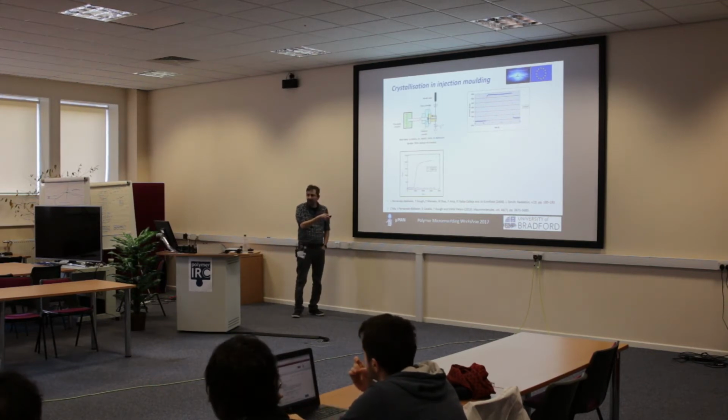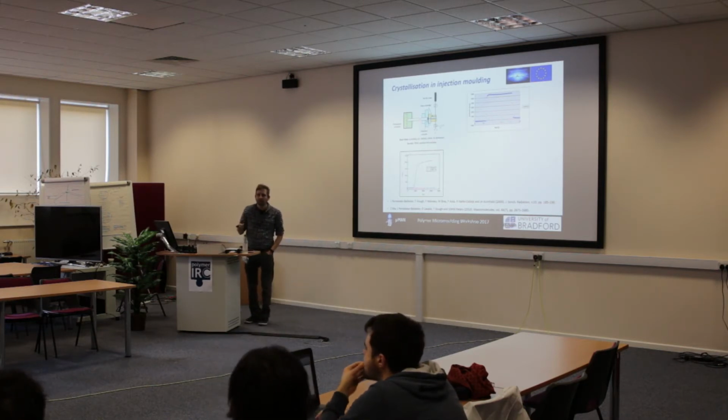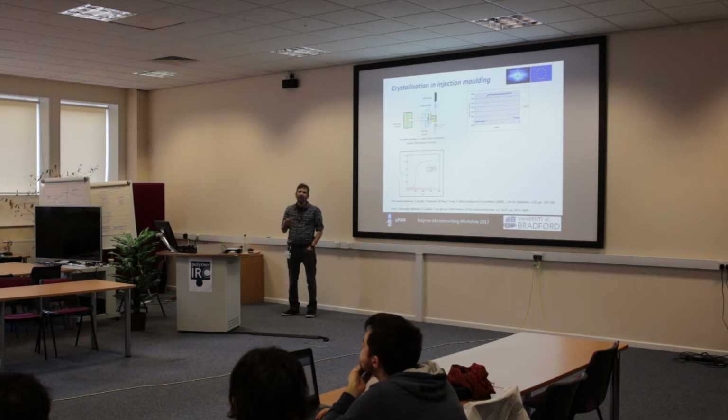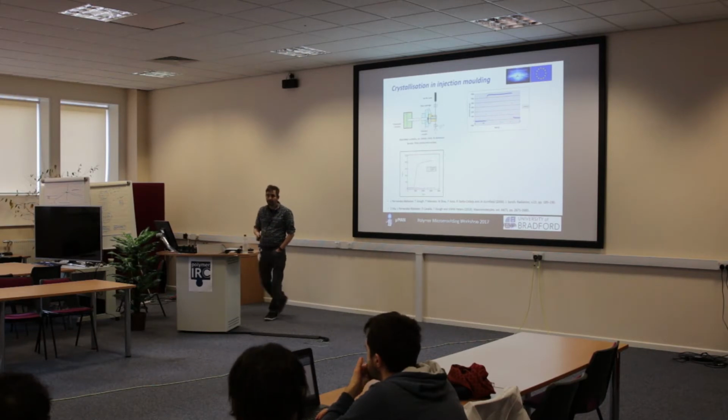This is a quiescent crystallization. If you just leave it to crystallize at a temperature near the crystallization point, maybe 1 degree below, after an hour, nothing has happened. The material will crystallize eventually, but in this material in particular, it took 3 days. Very, very slow.